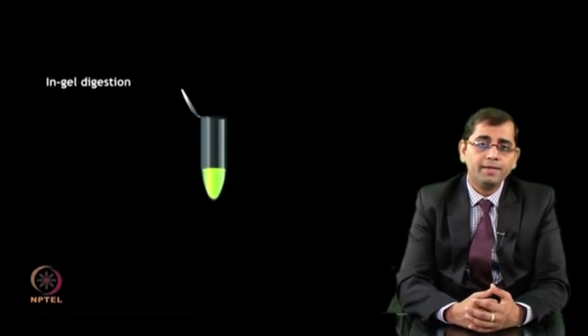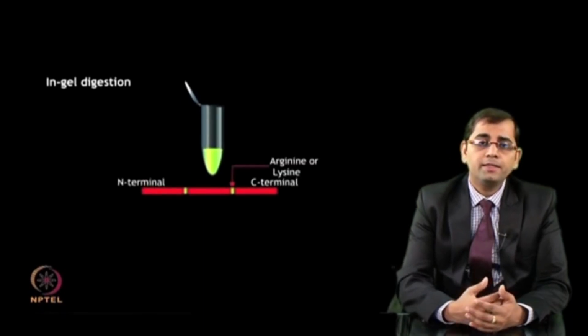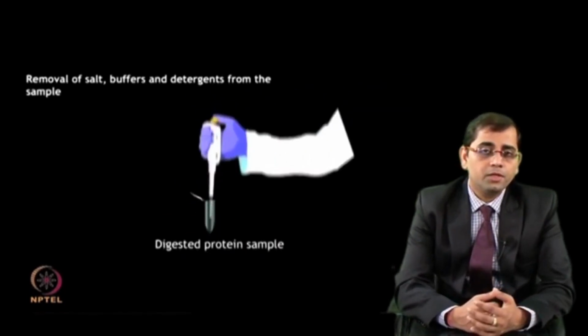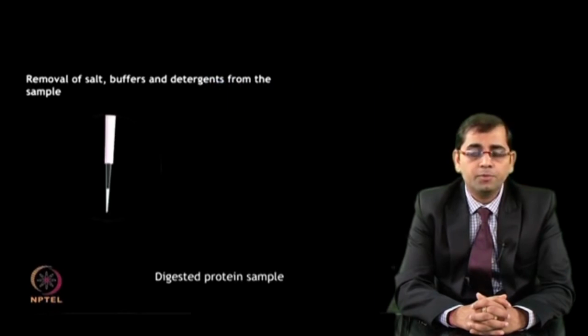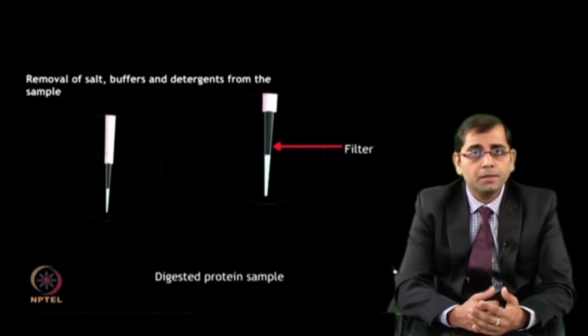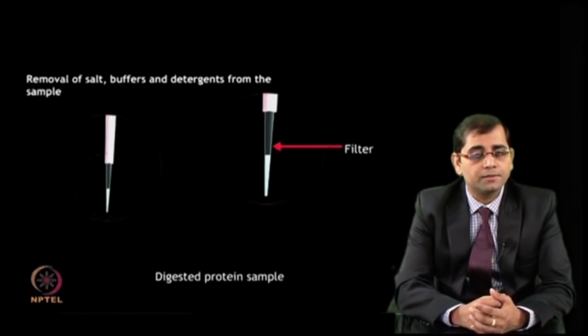Often the in-gel digestion is used to extract proteins or peptides separated on the gel electrophoresis. The in-gel proteolytic digestion is performed to cleave the protein of interest present within the polyacrylamide matrix. Mass spectrometric identification of the target protein greatly depends on the efficacy of the in-gel digestion protocol, which generates a mixture of peptides from the target protein through proteolytic digestion.